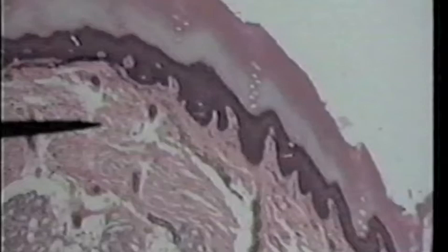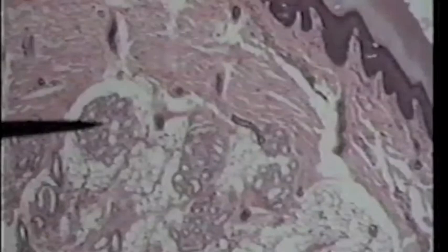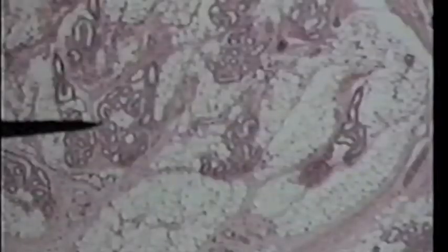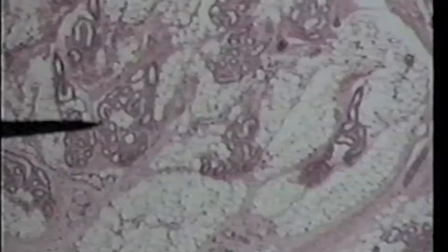There are some structures we need to look at in this region. We'll begin by looking at a sudoriferous gland. The tip of the pointer here is on a sudoriferous gland, or a sweat gland. It's just a cut through a coiled tubule that we call a sudoriferous gland. Here is another sudoriferous gland a little deeper in what looks like the hypodermis. It just cuts through tubules.